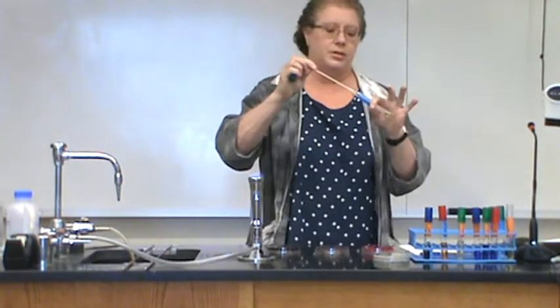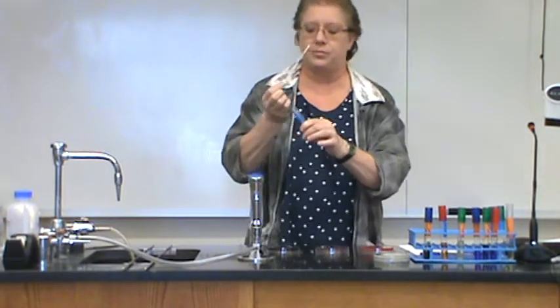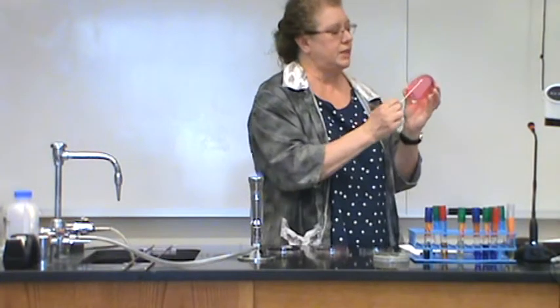Pick up your unknown number 1, the tube. Take the lid off, flame the top, go in, moisten your swab, flame the top, put the lid on, and then take that swab and just gently go back and forth across the surface of the MSA plate. Put that down, so now that's inoculated.